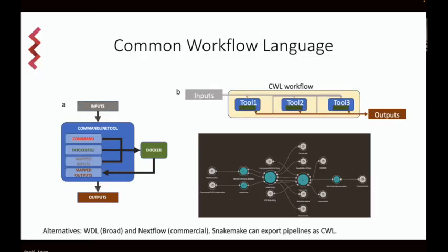Now, Krish asked me to talk a little bit about what we have under the hood, and our pipelines are all based on something called Common Workflow Language. So here I will step back a little bit to give you some background on where these workflow languages are coming from.